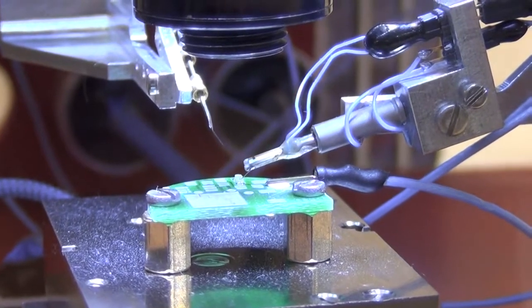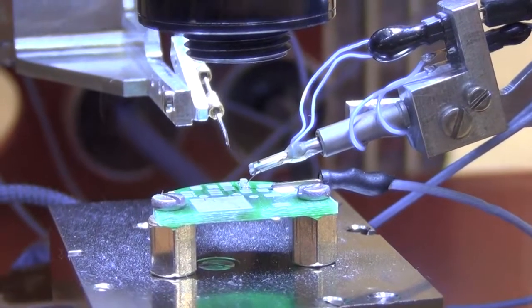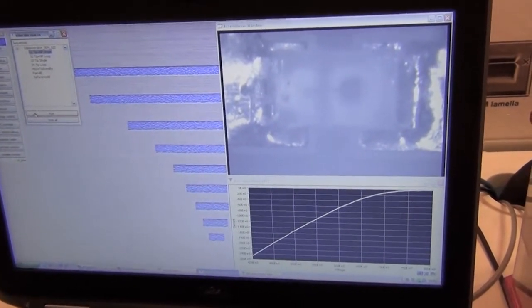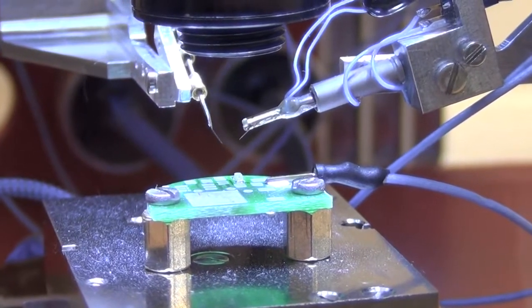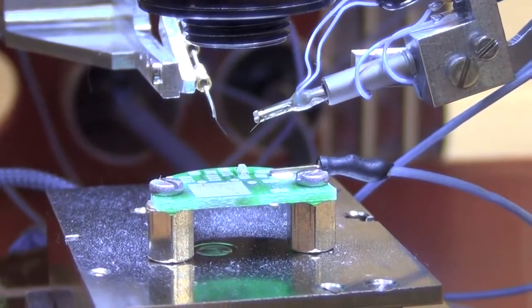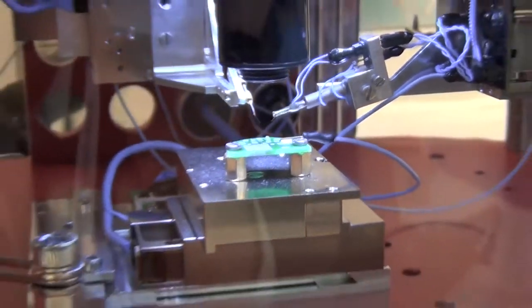It's done now. The nanofinger lands its tip by itself and now the electrical probe comes in and goes to the predefined point found by the nanofinger. And now an IV curve can be done. I cannot speak as fast as this process is. And that's the way how easy we can find unknown surface height and guide other tools.